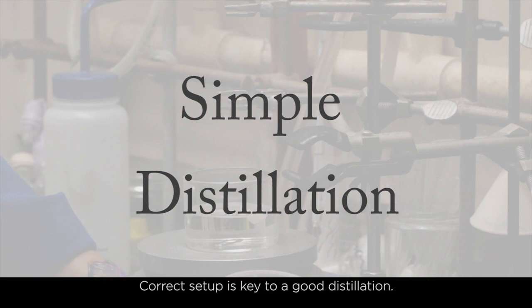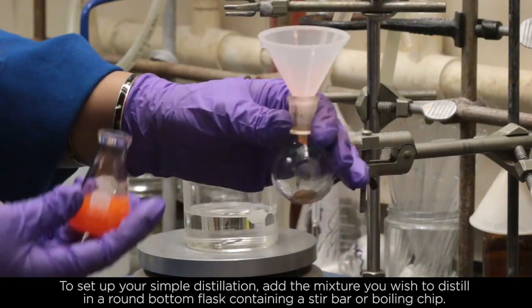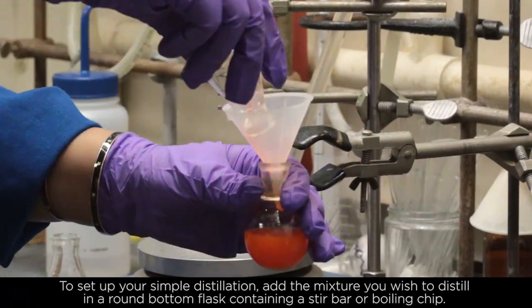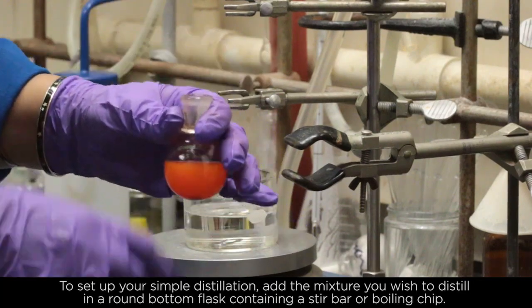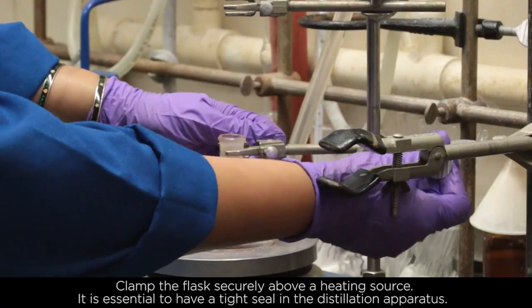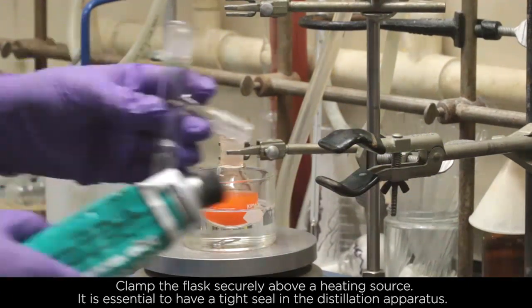Correct setup is key to a good distillation. To set up your simple distillation, add the mixture you wish to distill in a round bottom flask containing a stir bar or boiling chip. Clamp the flask securely above a heating source. It is essential to have a tight seal in the distillation apparatus.